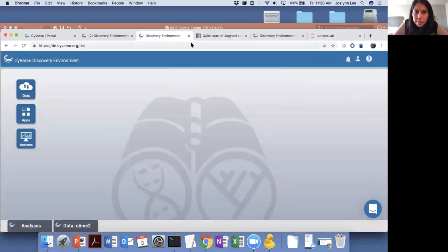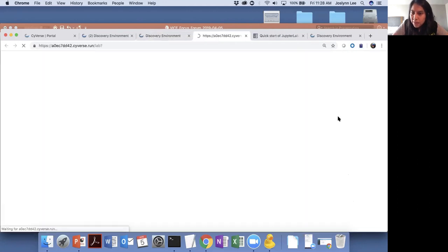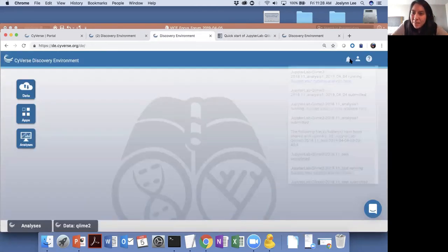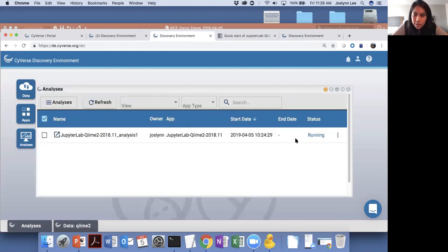Okay, it doesn't like that I have multiple windows up. Let me try this one more time. I had a backup analysis. When you do quite a bit of these webinars, oh, that's still not the correct one. Let's see.